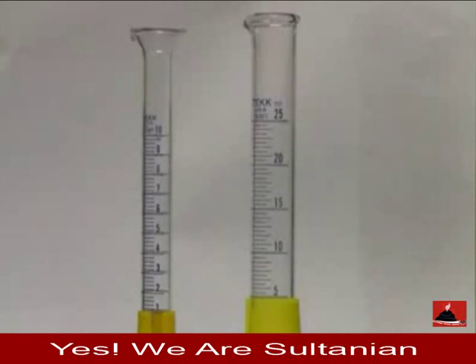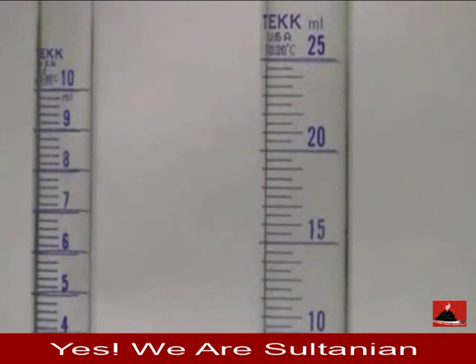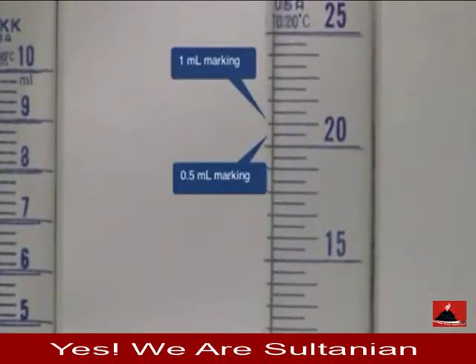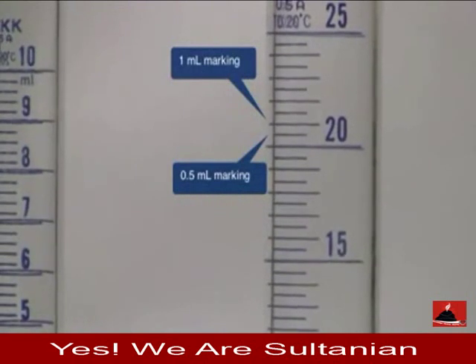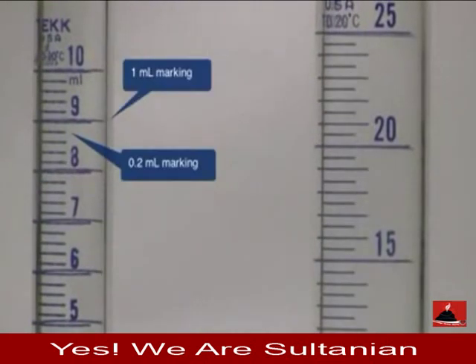If we look at our two graduated cylinders here, we have a large one and a small one. Each one is different, so it's always important to pay attention to what type of graduated cylinder you have. The hashes for each one can be different. On the large one on the right, the larger hashes are 1 milliliter markings and the smaller hashes are 0.5 milliliter markings. On the left, the larger lines are 1 milliliter markings but the smaller ones are 0.2 milliliter markings.